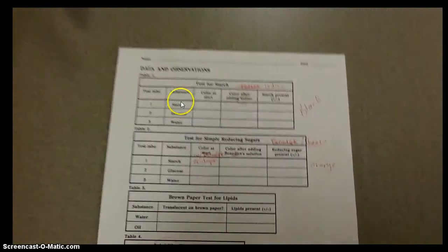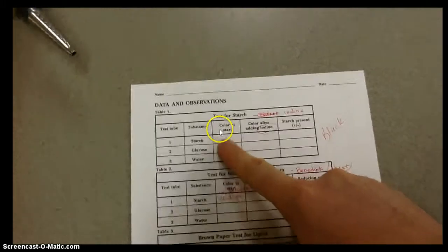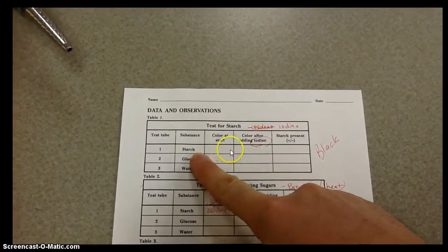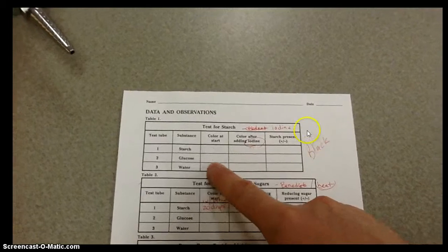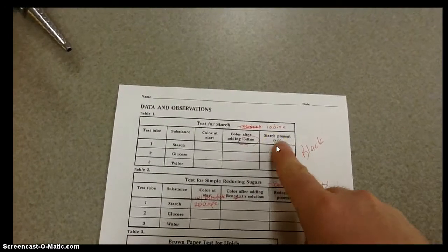Okay? Now, if we go back to our lab, what we have set up, I'll just show you here in a second. Lab number 1 is having you take 3 test tubes. Our first one is going to be labeled starch, second one glucose, and the third one is water. We are testing for starch. When we put each of the 3 liquids into the test tube, what do they look like at the beginning? I am going to add a couple drops of iodine to each of these individual test tubes. What does it look like? And if it turns black, then it does contain starch. Okay?